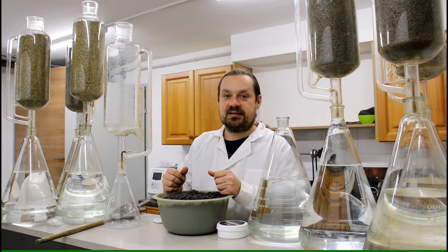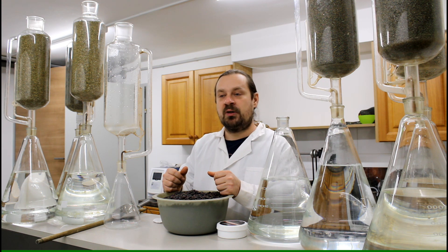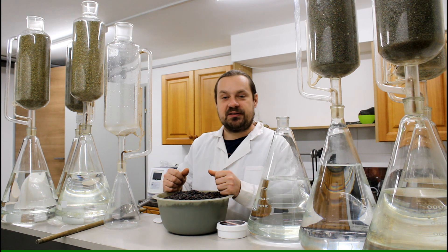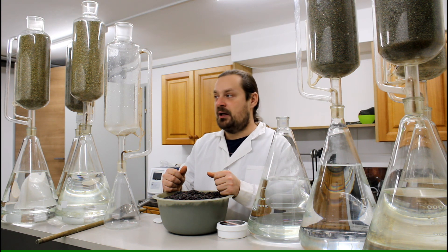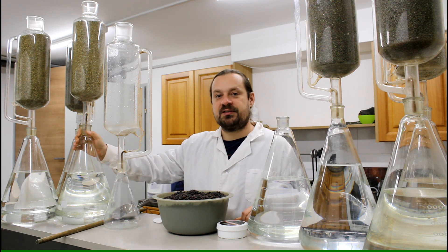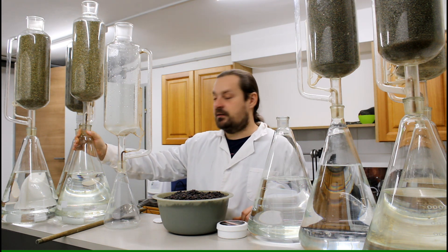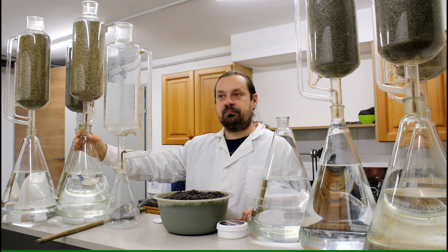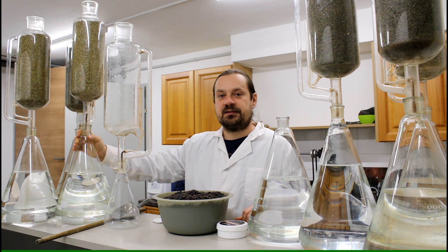With the Soxhlet method it's different — you can achieve a complete extraction. It only depends on how long you let the extraction run. I usually let it run for about 6 to 12 hours, depending on the actual herb being extracted. For most herbs I use about 70% ethanol, because this is a very good ratio between water and ethanol.